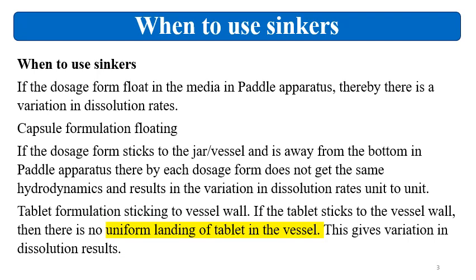In paddle apparatus, thereby each dosage form does not get the same hydrodynamics, and this results in the variation in the dissolution rates unit to unit. So tablet formulation also sticking to the vessel wall. If the tablet stick to the vessel wall, then there is no uniform landing of the tablet inside the vessel, and if this landing is not uniform, this will give variation in the dissolution results.